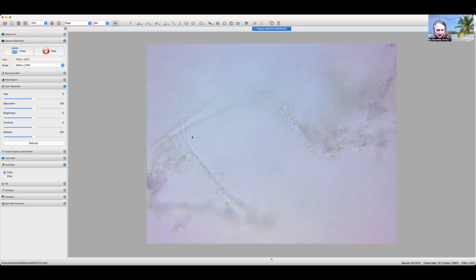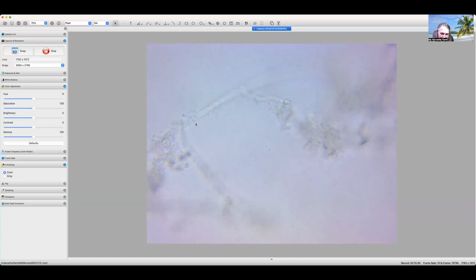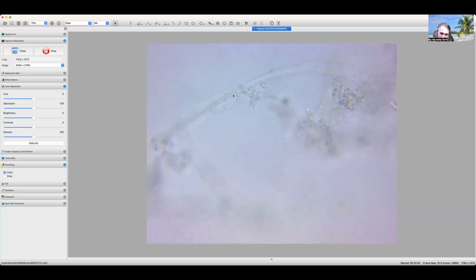Now let me try to do this with the left hand, and let me try to point out where I'm seeing the septa. Okay, here we go. We're about right in here. Yeah, see, I'm not seeing them going the wrong way. Okay, one right there. One septa, or is that the bacteria? That may be, I thought it might have moved.